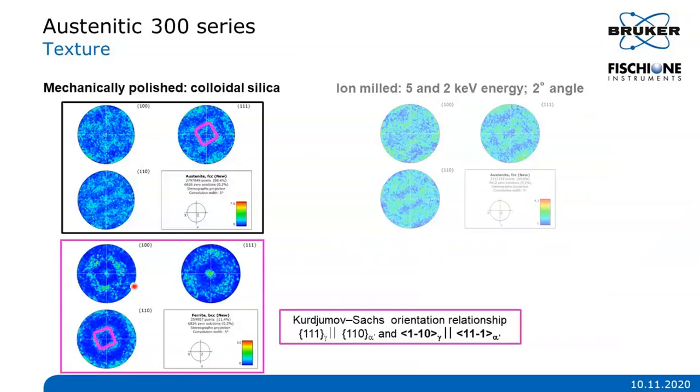This is a diffusionless dynamic phase transformation from austenite to martensite, which occurs according to a fixed crystallographic orientation relationship, described here. The observed orientation relationship seen in the pole figure is a direct consequence of the atom movements that occur during the transformation in the solid state.